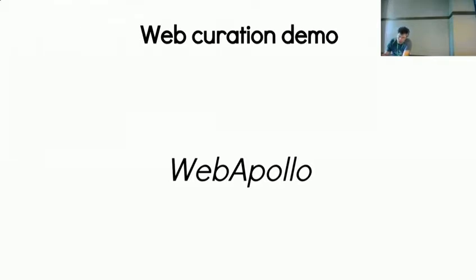This current version, and we're going to present this later tomorrow as well, has a Docker compose script that will bring all of this stuff up. But I'm going to go back and cover a little bit of the slides that I will be covering tomorrow. A lot of this was already covered by Troster. So, the structural annotations, I showed you the functional annotations, and you can edit both of these, and they both result in GFF3 and FASTA annotations.